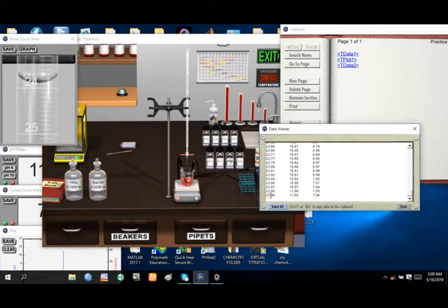Here is where the titration ought to have been, around 23.87. This is where our correct reading should have been, the first point where we recorded our results. So in this titration, we now know that approximately it is about 23.87 and the pH is 10.97. So we can copy all these results to a spreadsheet to produce an accurate result.